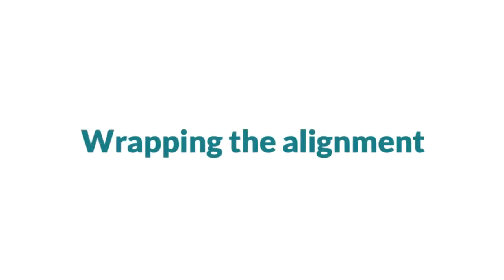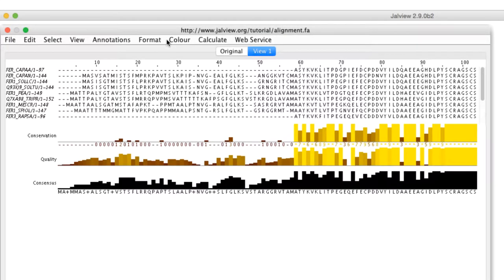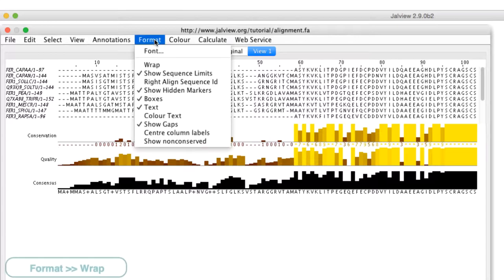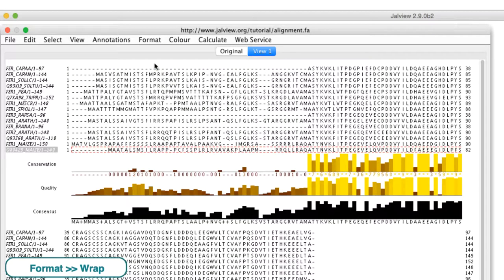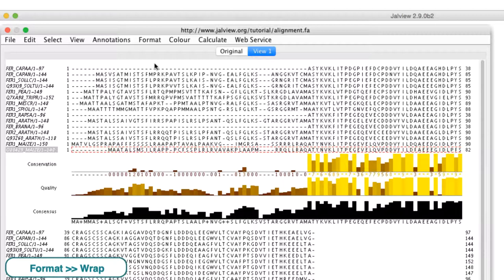There are a number of ways to customize the Jalview alignment window. By default, the alignments are displayed in the unwrapped style where each sequence is in one long line across the window. The alignment can be wrapped by going to the format menu and selecting wrap. Each sequence now lies on multiple lines that fit the width of the window. Notice that the annotation lines are also wrapped.